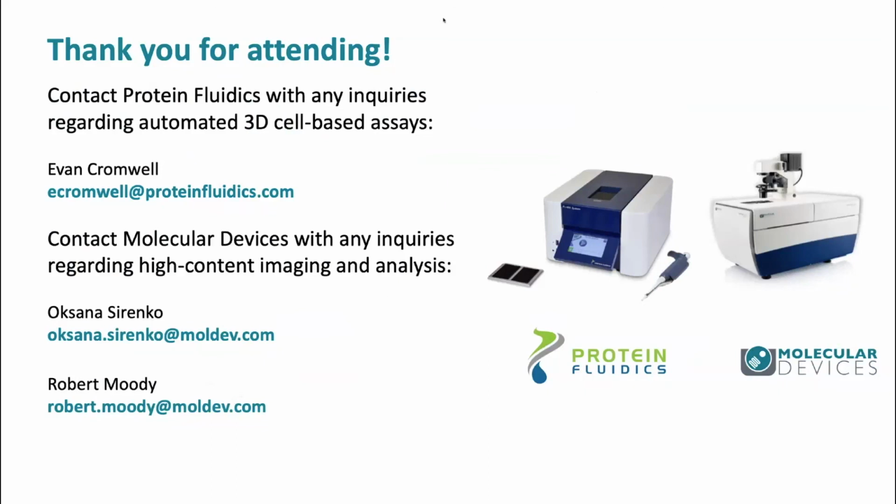For something like tumor-derived spheroids, which are pretty solid, you can go in with 10x magnification up to about 200 microns, with decent resolution so that you can still see the structures and different cells. But organoids, surprisingly, since they're more transparent and have a cavity inside, you can actually image much deeper and much bigger structures.